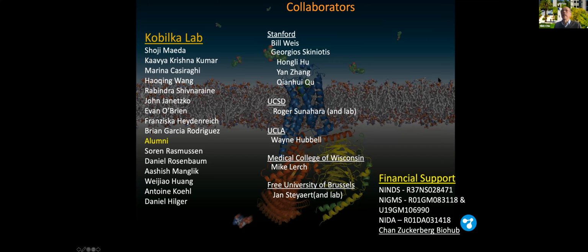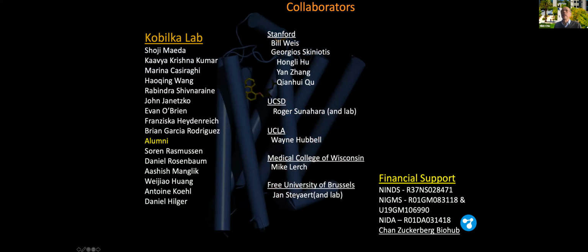Yeah. So there's another question from David DeRosier. The question is, do you understand why the detergents and lipids are necessary for the prep? Why the detergents and lipids are necessary? Yeah. Well, these are native membrane proteins, and the outside of the protein is largely hydrophobic, so it wouldn't be soluble in an aqueous solution without detergents. Many of these also really are cholesterol binding proteins, and many GPCRs require cholesterol to be fully stable. So even if we're using detergents, we use a mixture of detergent and cholesterol.